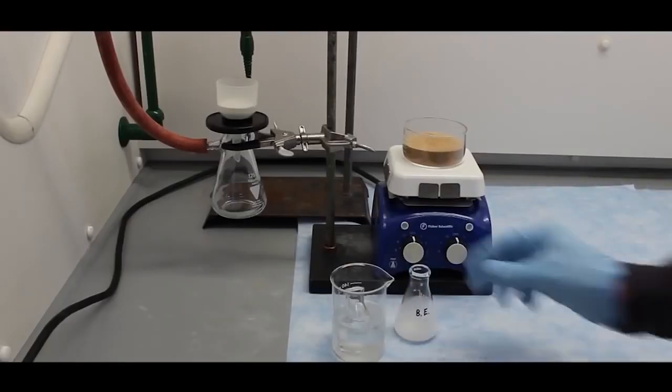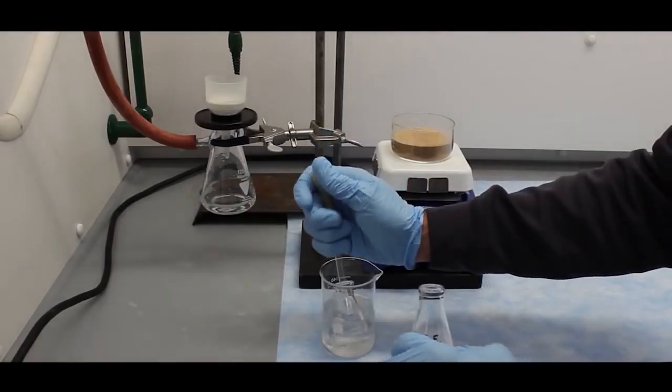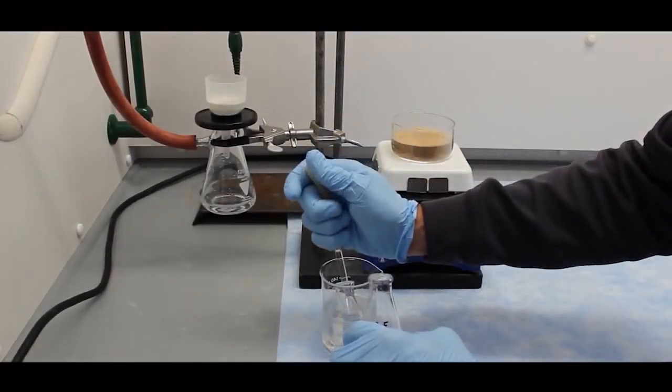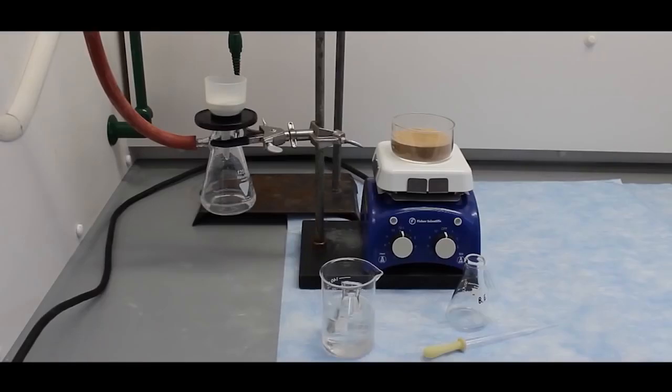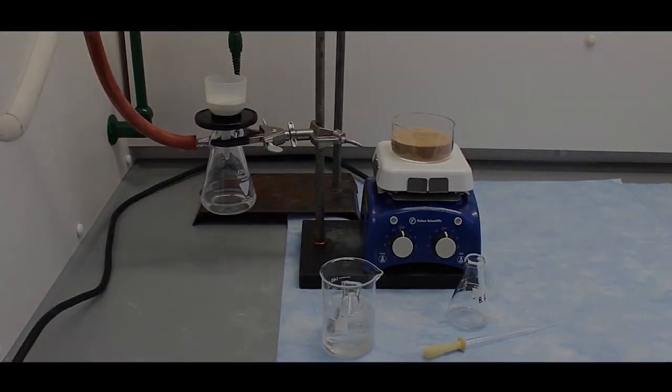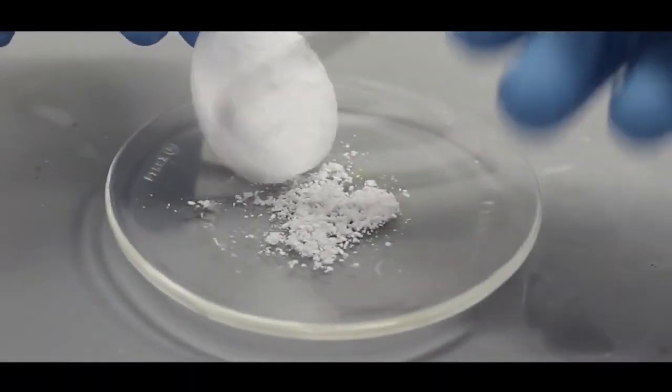I will collect the solid using vacuum filtration. I will wet the filter and attempt to transfer as much of the benzoic acid as possible. I will then rinse the flask a few more times, and then leave the solid to dry on the vacuum for a while. When it's dry, I will collect it on a watch glass and record its mass.